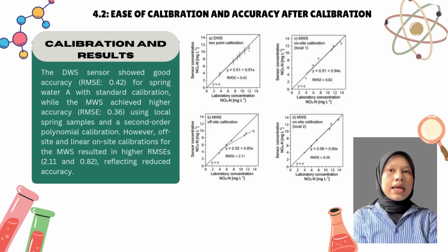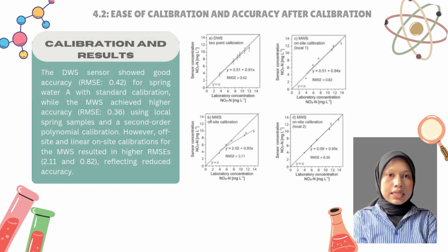These results highlight the importance of calibration methods tailored to specific water matrices to ensure optimal measurement precision. The findings underscore the value of localized and advanced calibration techniques for improving analytical reliability in water quality assessments.